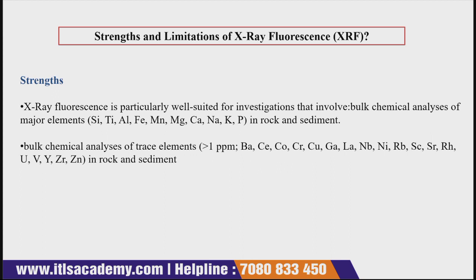If you talk about the advantages, X-ray fluorescence spectroscopy is particularly well suited for investigations that involve bulk chemical analysis of major elements like manganese, magnesium, calcium, potassium in rocks and sediments. So basically it is used in the bulk analysis of major elements that are present in rocks or in sediments.